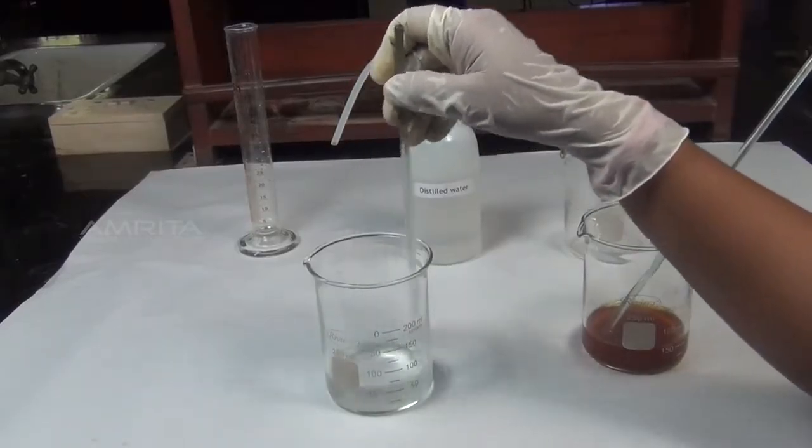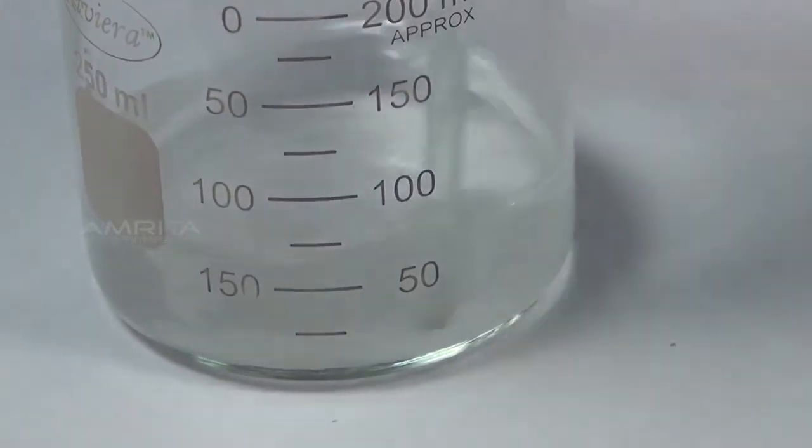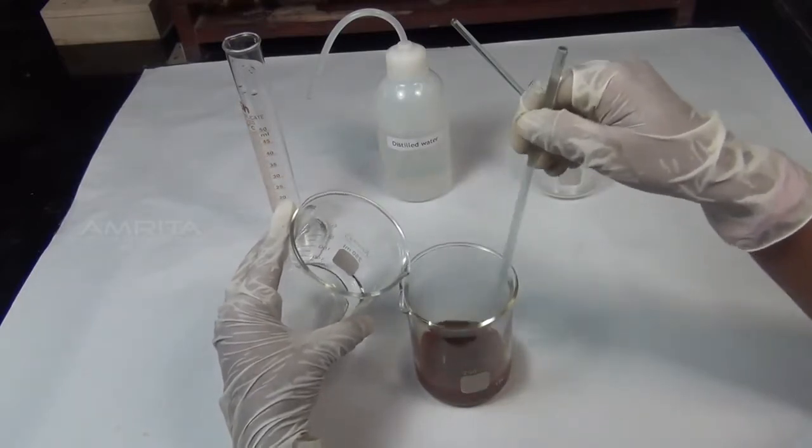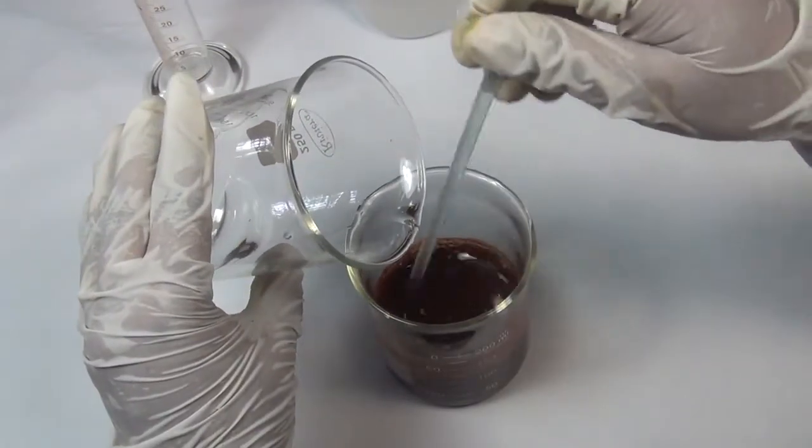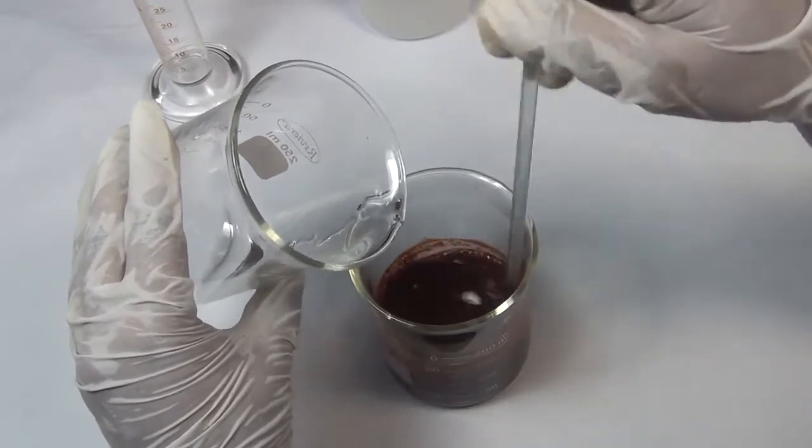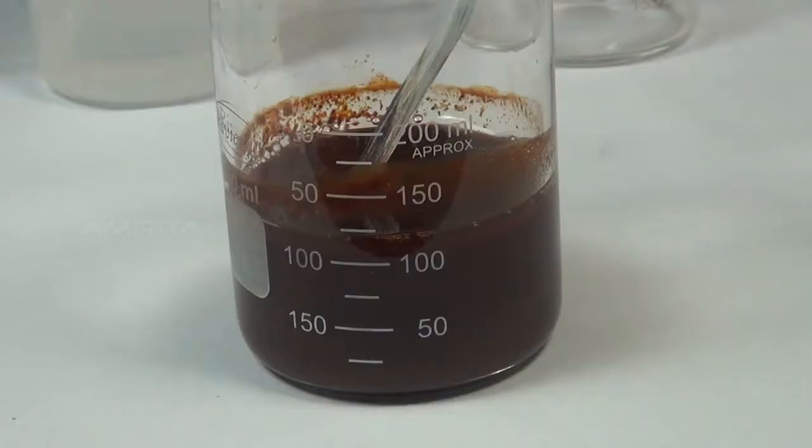Add potassium hydroxide solution to ferric chloride solution in small proportions with constant stirring using a glass rod. Ferric chloride reacts with potassium hydroxide to form a brown precipitate of ferric hydroxide.